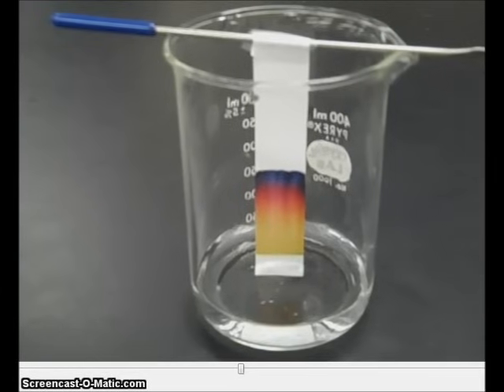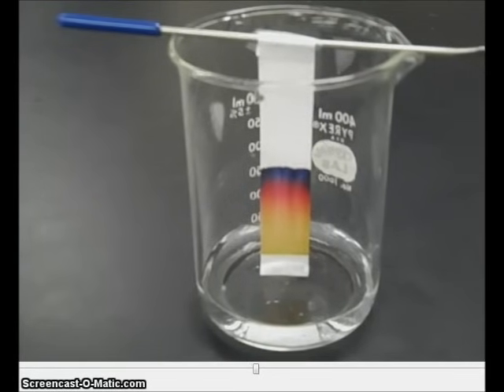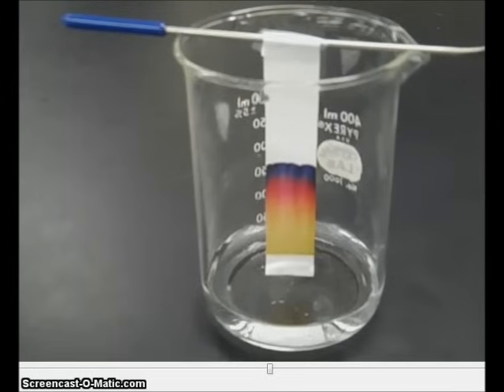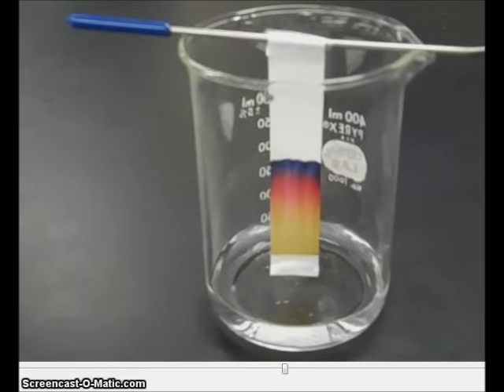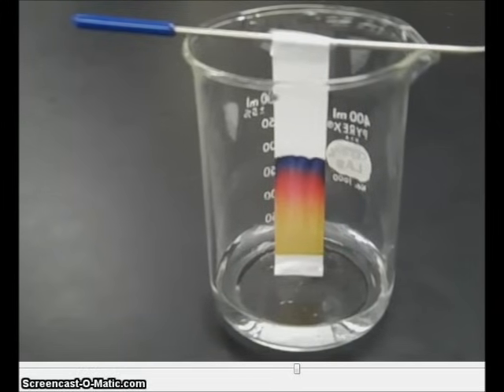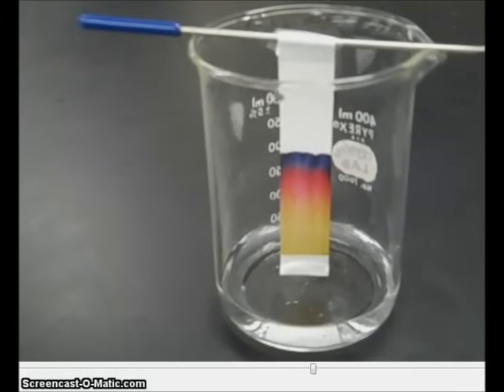This is because the different pigments have different properties. Some of them are heavier, some are lighter, some are more soluble in water, some are less. Because of these differing properties, all of the different colors are going to travel at different speeds.